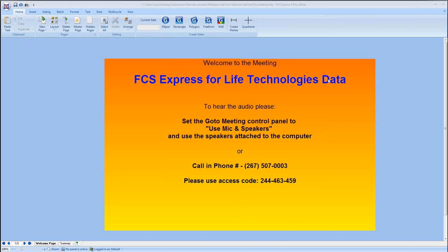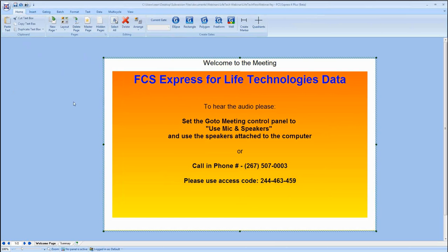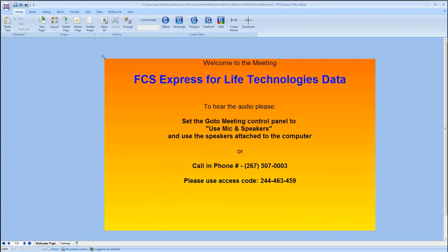So to start, we're actually in FCS Express right now. This welcome to the meeting screen is actually just a large text box. And FCS Express looks and feels just like Microsoft PowerPoint. And that's not by accident. It's totally by design.